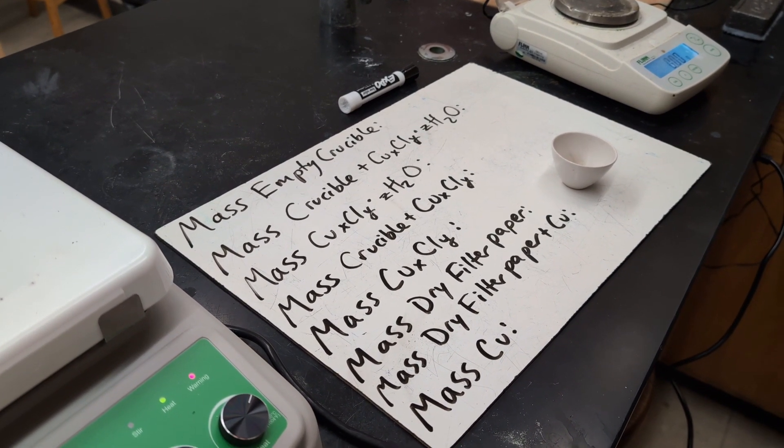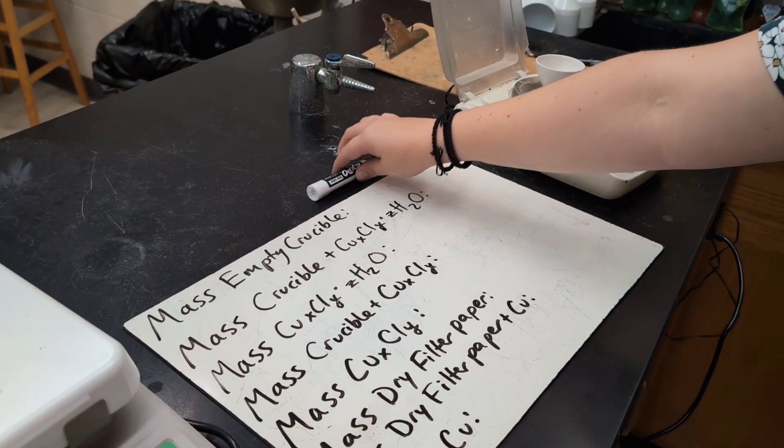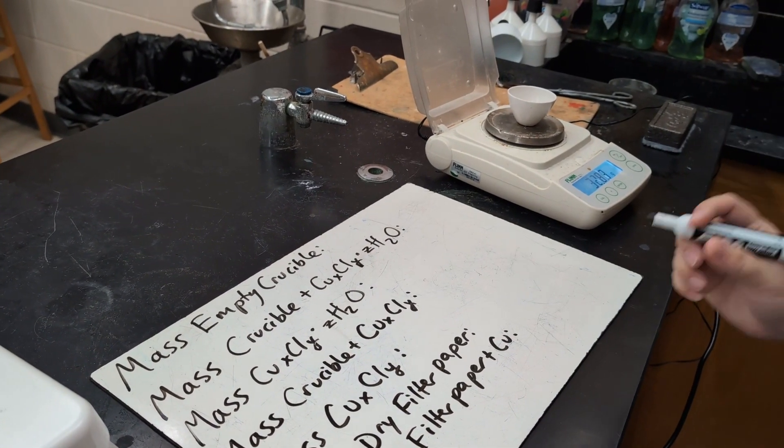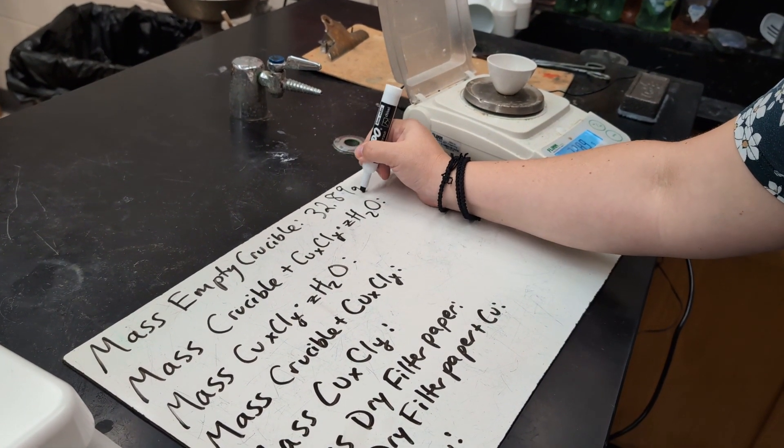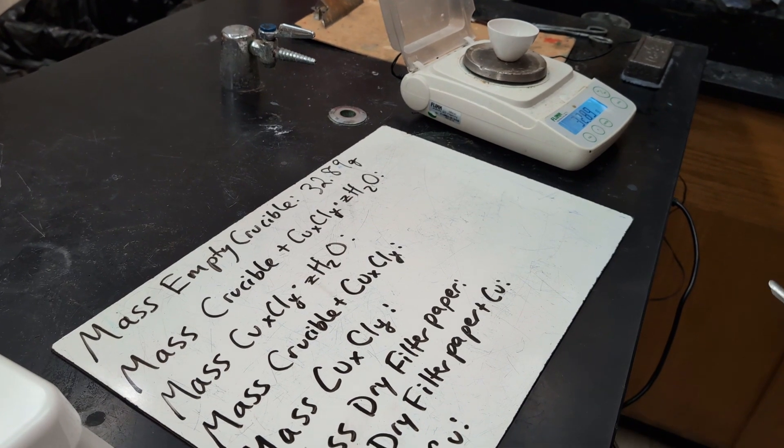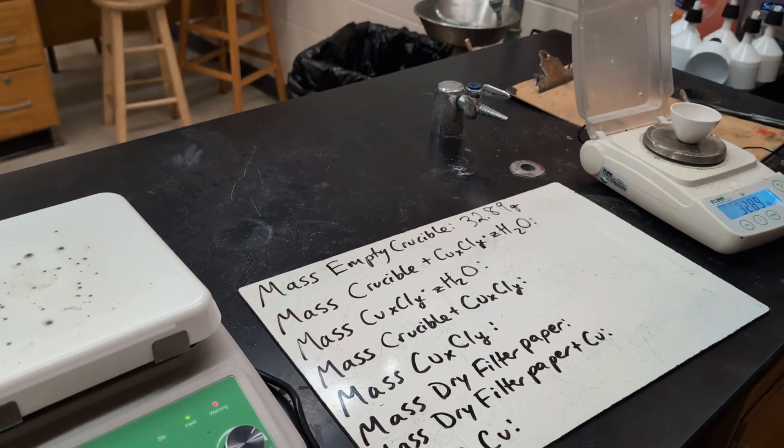So the first thing we want to do is find the mass of our empty crucible. And I got 32.89 grams. Now you can use an analytical balance for slightly more precise measurements, but I found the hundredths place is usually pretty good.